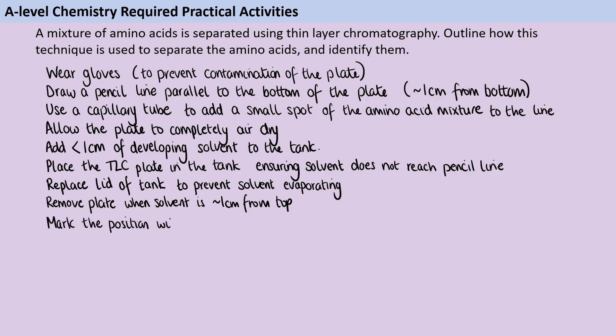Then we're going to mark the position that solvent reached with a pencil line. We know that's where my solvent front was because we're going to need that information for calculating the RF value later.